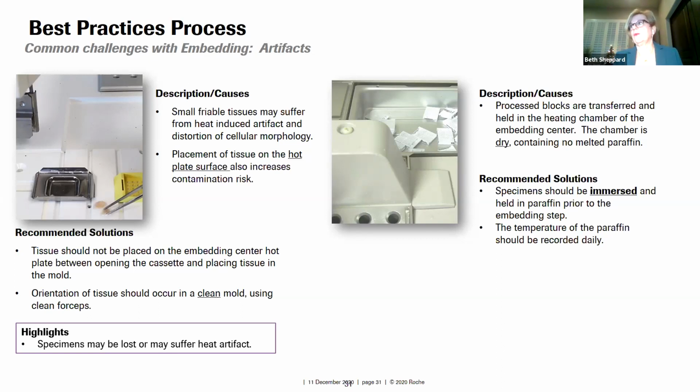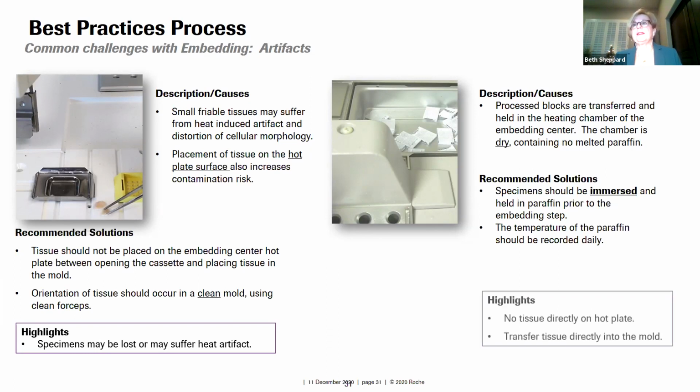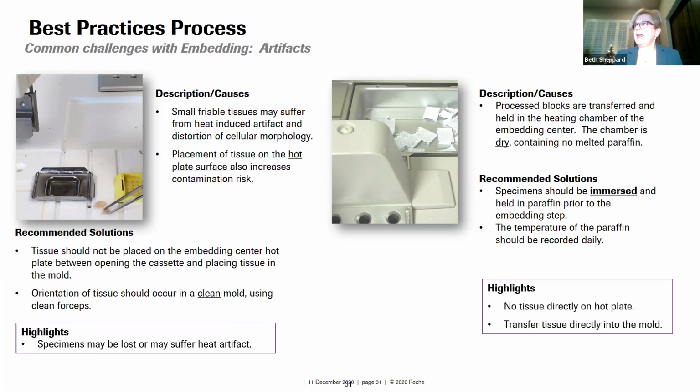The other one that you want to make sure of, like I said before, is that the chamber is not dry. You never want to embed from a dry chamber. You want to make sure it's immersed and held in paraffin prior to the embedding step into hot, melted paraffin, and transfer it directly from there to the mold.